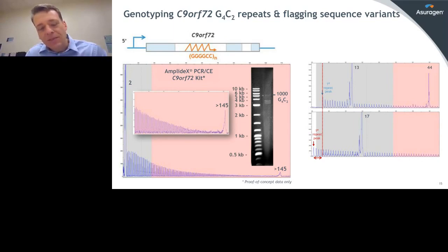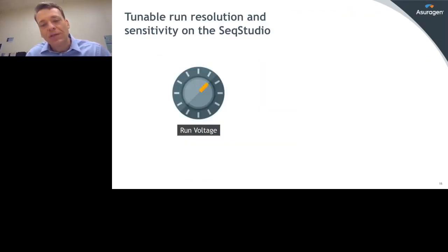And since the peaks themselves are distanced by 6 nucleotides, slightly less than 4 peaks should represent slightly less than 24 base pairs. And since they're shorter, you would expect that this may represent a deletion. And in fact, that's exactly what we observed. When we sequenced this region by Sanger sequencing, we found that it's a 23 base pair deletion.